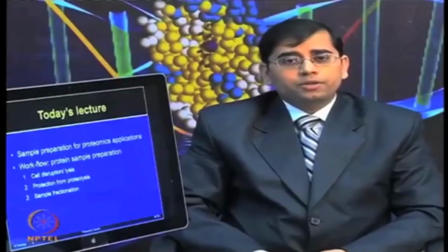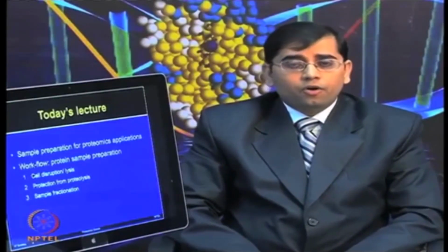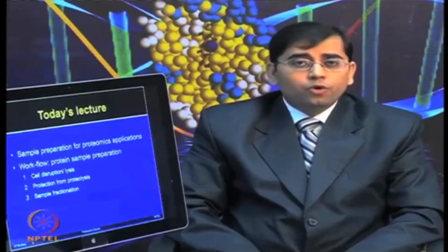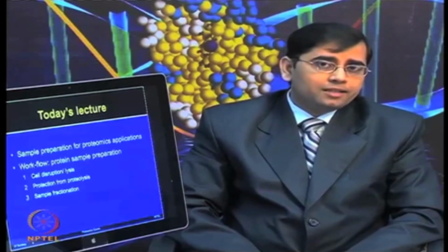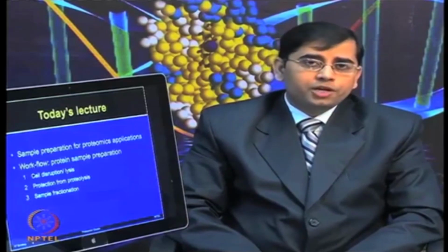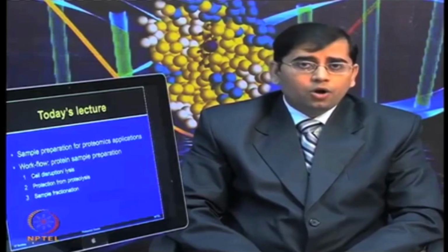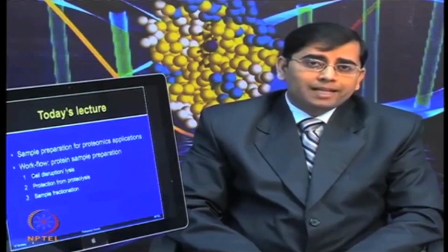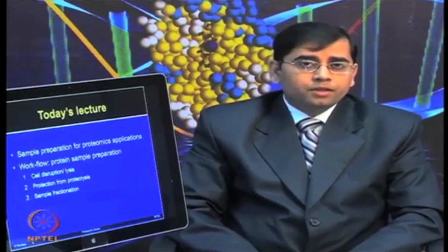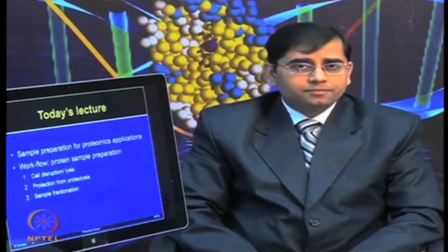Now, when we are talking about sample preparation, this is quite generic for different types of proteomic applications, whether one wants to use gel based approaches or gel free approaches. So, whether you want to use 2-dimensional electrophoresis, dyes or different types of gel based applications, or you want to perform mass spectrometry and different types of label free techniques, you have to ensure that you are starting with a very good protein extract.